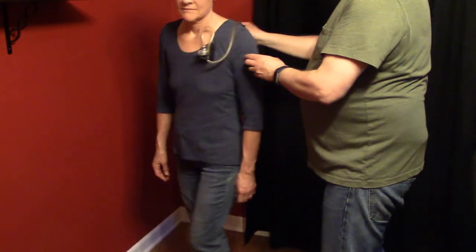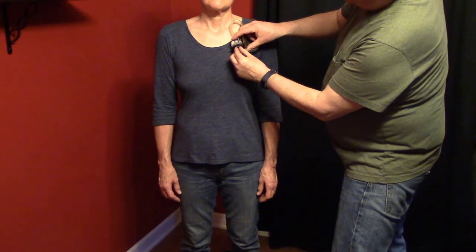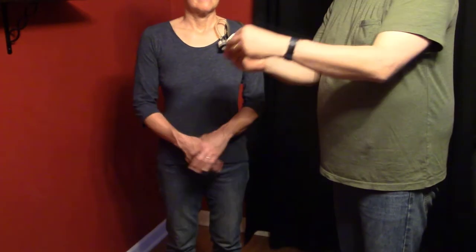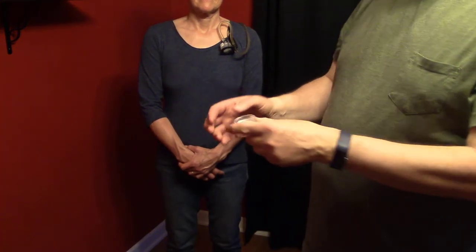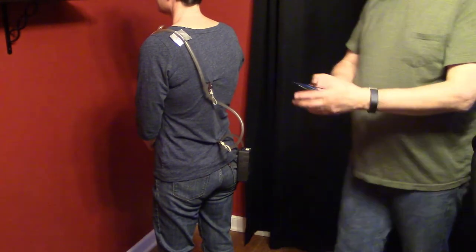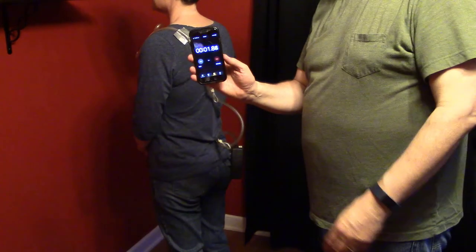Next I take the cap off the inlet to the filter. Then I need to put out a field blank — I remove the caps from the field blank, record the field blank number, and set it out near where the worker is working. Then I'm ready to turn on the sampling pump: I hit enter, the pump is running, and I also start the timer on my phone.